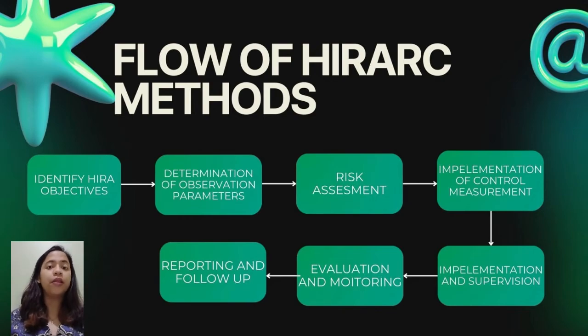The next step is implementation and supervision. On this stage, the implementation of each hierarchy that has been analyzed will continue to be carried out by us as students during water sampling activities, which will be supervised by lecturer, staff, and also laboratory assistant.